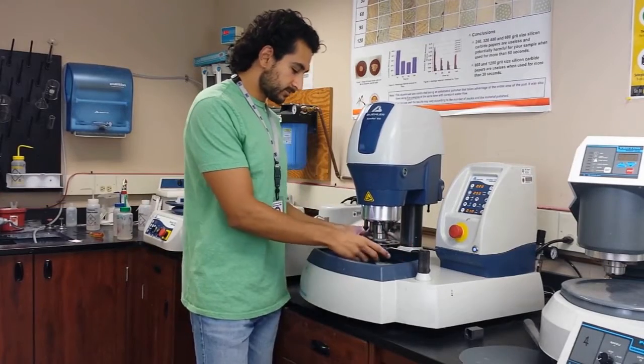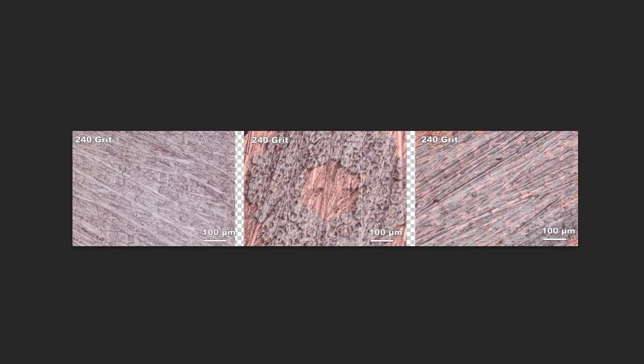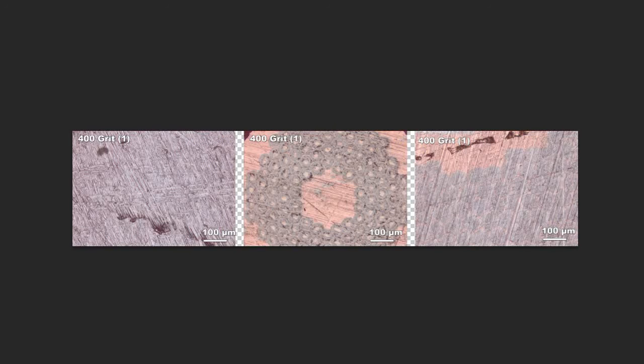Alright, let's go check this out. I've done one step of 400. You can see it's looking a lot better than before. Let me show you — this is 240 grit, this is 400. Much better, right? You still see some weird stuff, and of course one step was not going to completely take out all the damage that the 240 introduced. This one looks much better. There's maybe this deep scratch still, but that's not too bad. These are though — I need to get rid of those. So I need to do at least one more step. I think two steps total will be good enough.